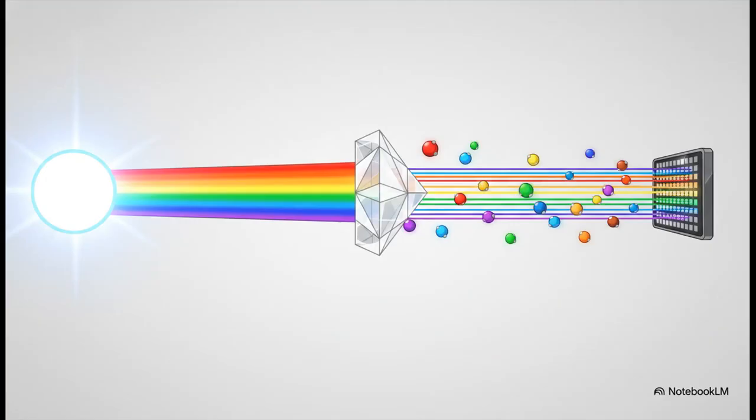Okay, this is where it gets really exciting. Representing the single biggest leap since Walsh's original work in the 50s, we have high-resolution continuum source AAS, or HRCS-AAS. This completely revolutionizes the field. By using a super high-intensity xenon short-arc lamp paired with a double-echelle monochromator, which basically acts as an ultra-precise optical sieve, and a modern CCD array detector, we can suddenly scan wide spectral windows all at once.